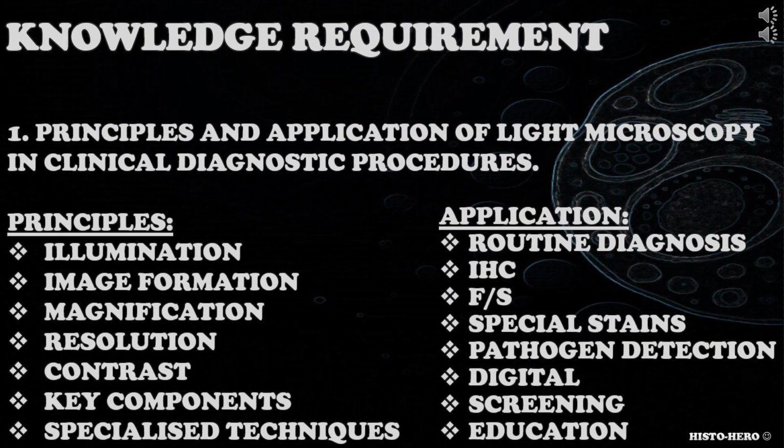The knowledge requirement explains what knowledge is expected of the candidate in relation to the relevant subsection. Candidates should be able to demonstrate their knowledge at the specialist level. Think about what knowledge they had as a Band 5 BMS. How would that differ to the knowledge of a Band 6 BMS? That specialist level of knowledge would allow the candidate to troubleshoot, problem solve, verify or validate.